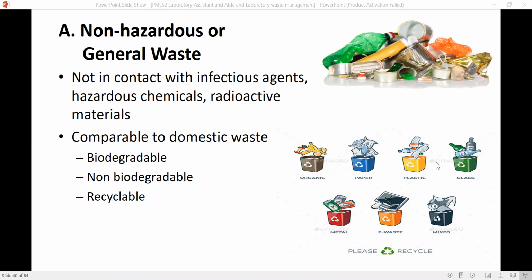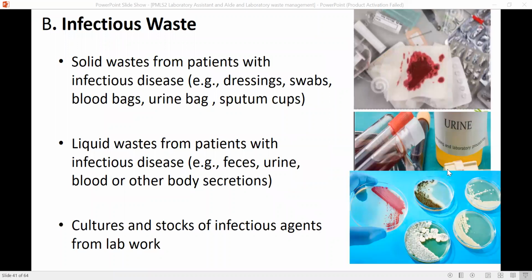Okay, mga paper, okay, plastic, plus nakahiwalay na mga metal. So mas maganda sana pag ganyan. Okay. Now, infectious waste, yan sa laboratory, marami nito. So ano ba yung mga examples niyan? Basta merong specimen coming from the patient.